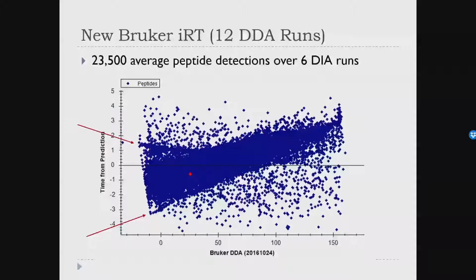And so what do people see here? Actually, I got little lines as hints. What do you see here, and what's the problem? No, it's not temperature in the lab. I mean, we improved the library builder based on this, but what do you, like, so I've just shown you two problematic cases, what do you want to see here?